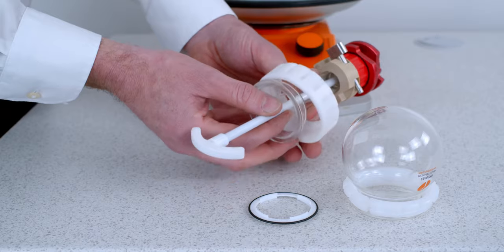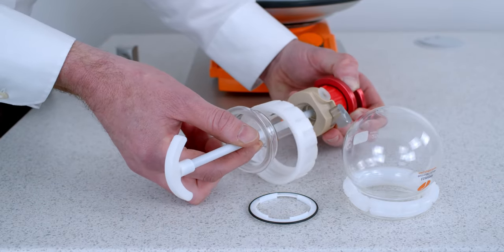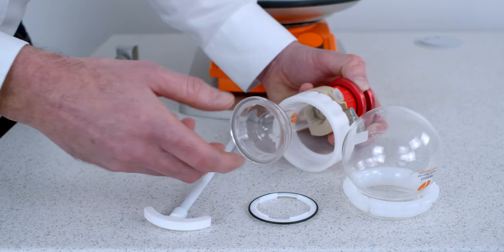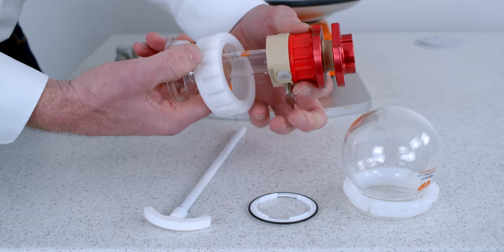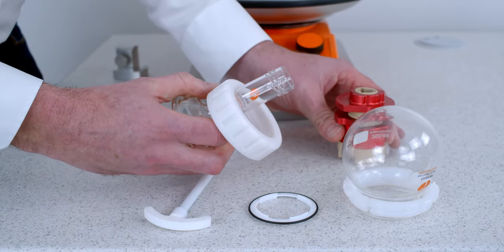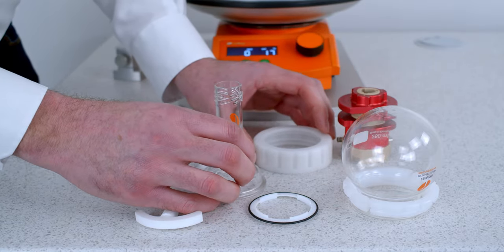Next we need to remove the stirrer paddle. To do this you just pinch the guide at the top and that allows you to remove the paddle. Then we're just left with the stirrer guide at the top, which is a quick quarter turn to remove the top of the coupling, and then we're left with the reflux tube.